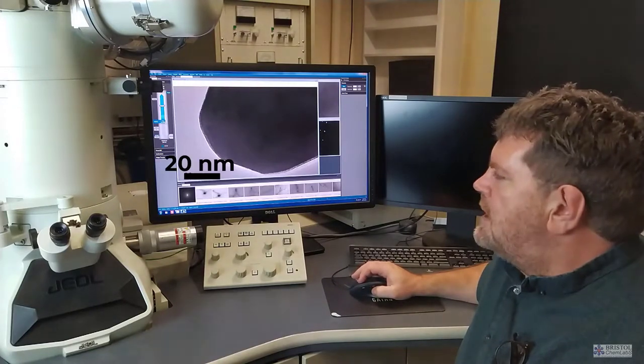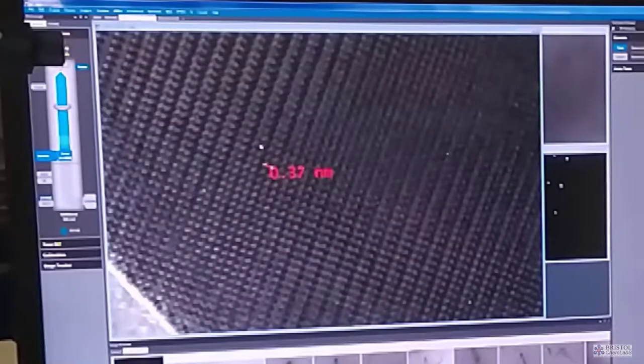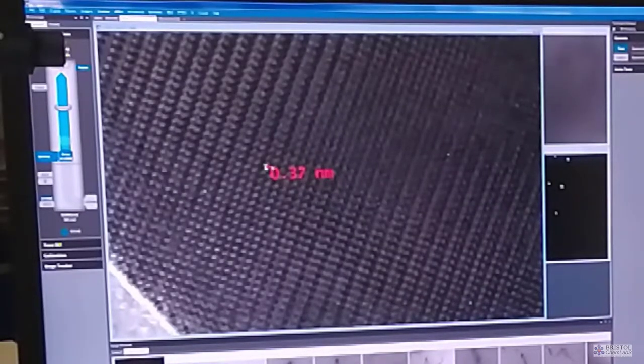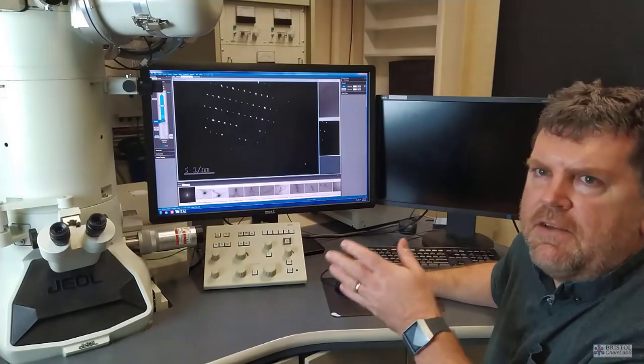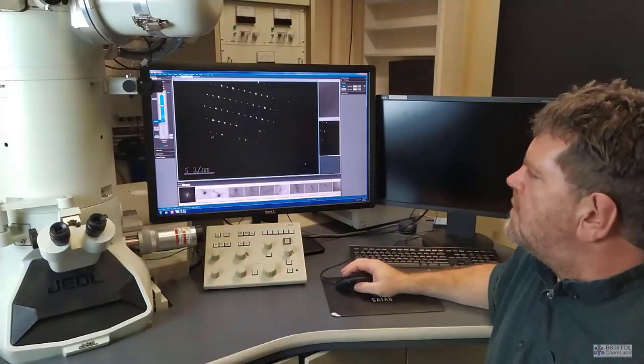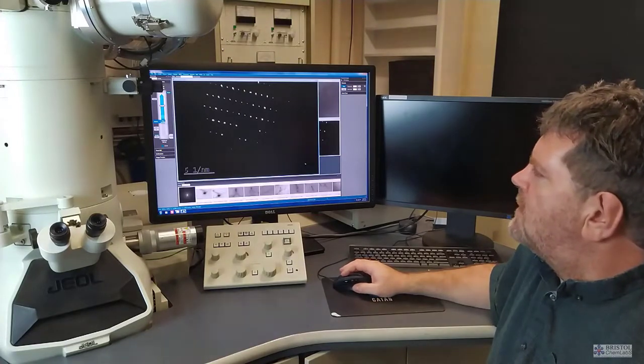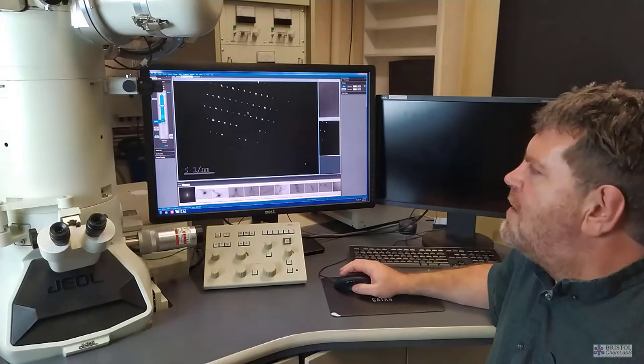So the scale bar in this image is 20 nanometers, or 20 times 10 to the minus 9 meters. As we zoom in to these materials, we can see the arrangement of the constituent ions within the material. We can see the separation between these two bright spots, which correspond to some of the heavier ions within the material, is of the order of 0.37 nanometers. So effectively, we are seeing the lattice planes directly within the crystal and measuring the separation between those crystalline planes. As the electron beam generates the image, it also produces a diffraction pattern. And the diffraction pattern is just produced at a different plane to the image within the instrument. So we can record the diffraction pattern and the image simultaneously. From this diffraction pattern, we can also get information on the structure and crystal form of the material from this diffraction information.